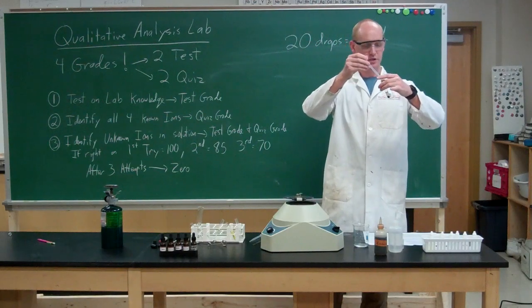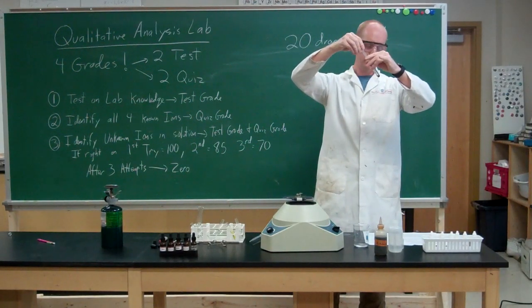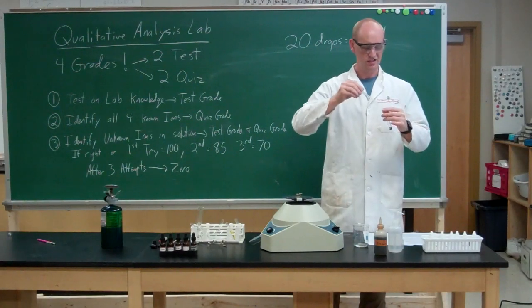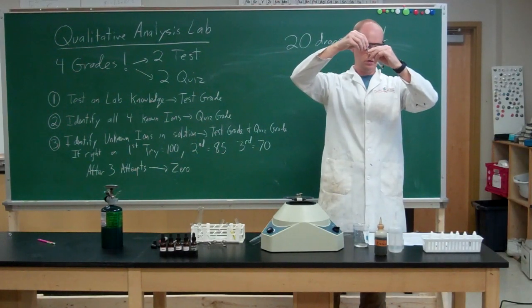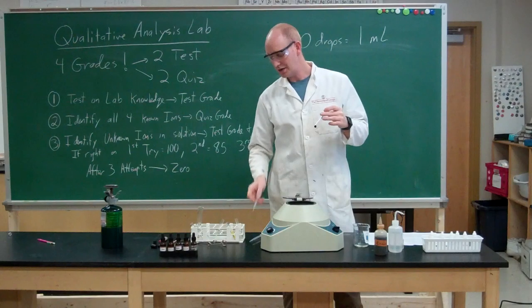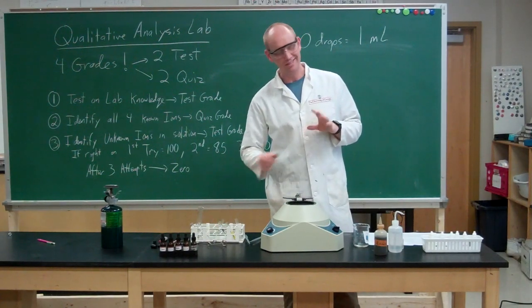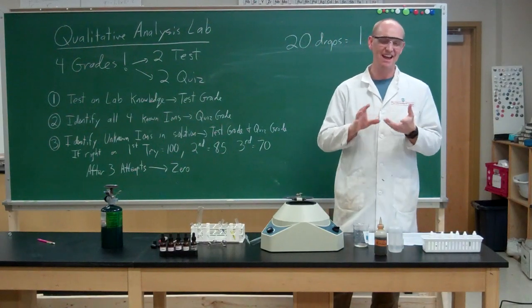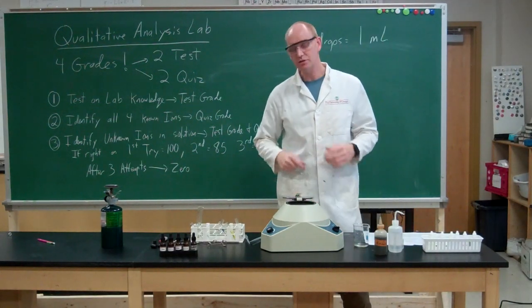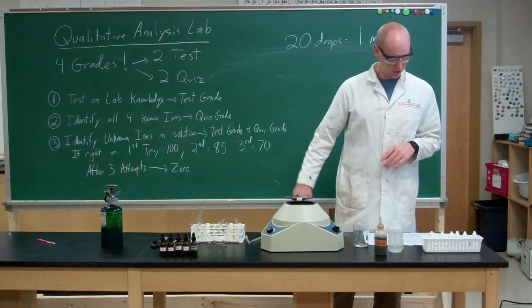This is my second washing. So squeeze my pipetter, pull that liquid off, and that one is a discard. All right. Now, if you mess up the washing, that's one of the easiest ways to get things mixed up and to have errors in this lab. So make sure you're organized to make sure you wash it correctly. I'm going to wash it 3 times.